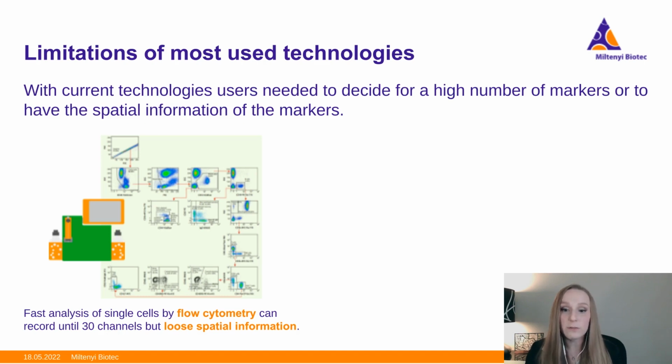However, by doing flow cytometry, you normally have to do something like dissociation to be able to get those individual cells to analyze. And this loses all the spatial information that you would have gotten had you kept the tumor intact. And as we saw, there is also the spatial distribution and the interaction between these that we want to be able to investigate, as they might play a role in what's going on in this case as well.